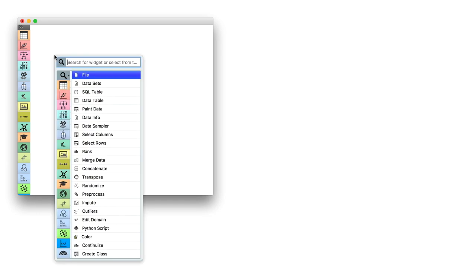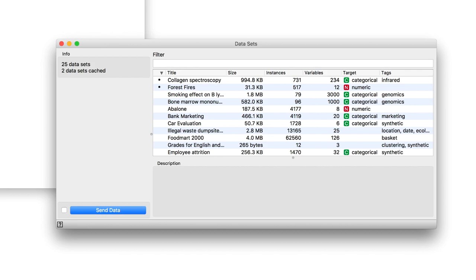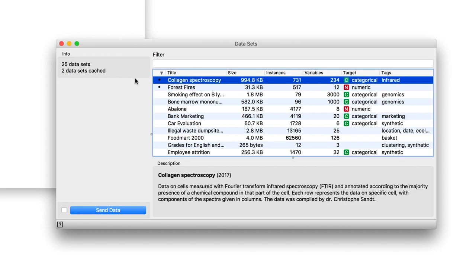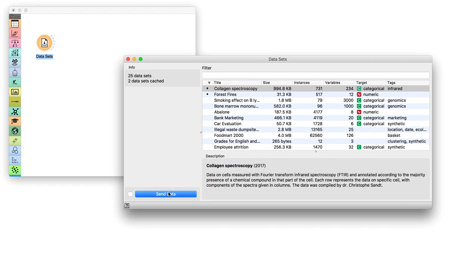Now let's build a workflow for an easy task of normalizing, baseline correcting and then visualizing a series of spectra. First, add the Datasets widget from the Data panel. Open Datasets and look for the Collagen Spectroscopy dataset. Select it and click Send Data.